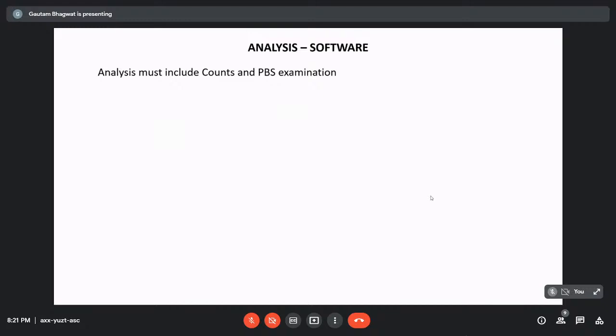the person who is analyzing should himself look into the slides. If not possible, then at least he must have a morphology report with him, because it is an integrated dosage of morphology with flow cytometry, and without morphology it becomes very tough to analyze in many cases.